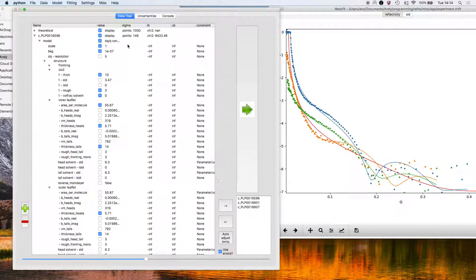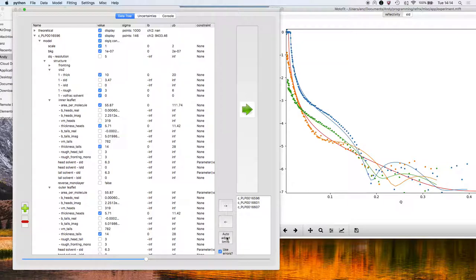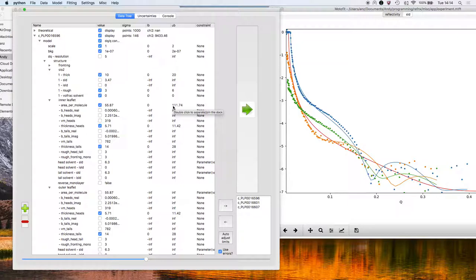The next thing to do now is to have some sensible limits for the fit. So I'm going to click on auto-adjust limits, and it gives some sensible defaults for a limit. I mean, when I say sensible, it chooses zero as the lower limit, the lower bound, and twice the parameter value as the upper bound.